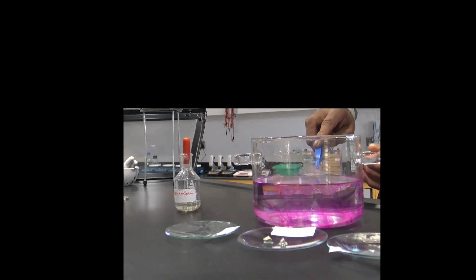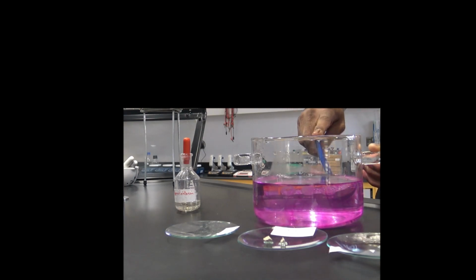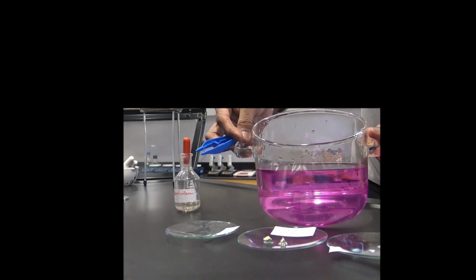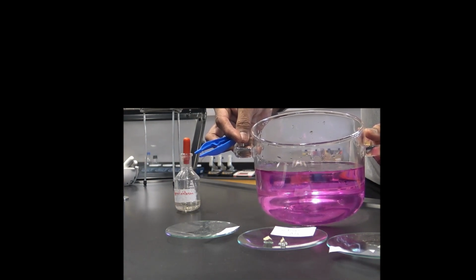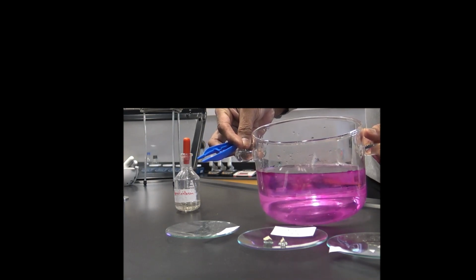The fizz shows that hydrogen gas is there, and of course it is moving around the water because of the reaction. I expect that when I do the same thing with sodium and potassium, I will have a faster reaction. You can hear the fizz here, moving around the water. You can see clearly the solution has become purple, which shows that an alkali is forming after the reaction.